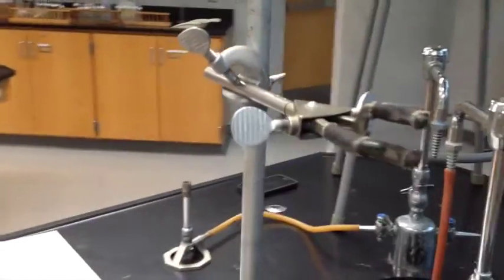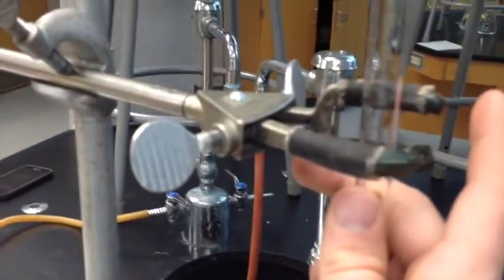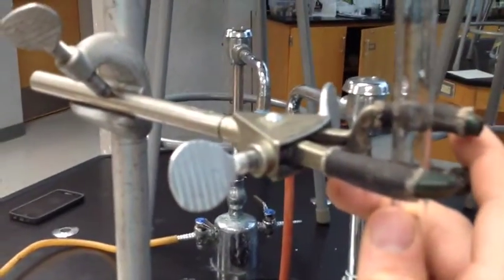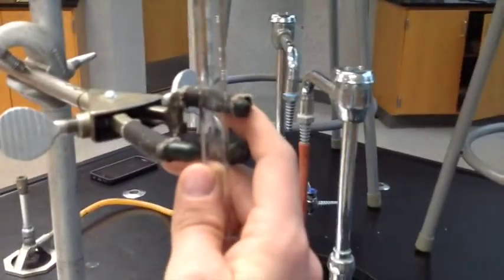Aha, there it is. Use a clamp, a 3-fingered clamp, and you'll slide it in and have your partner tighten both set screws. Now it's important that you don't over-tighten those screws. You can squeeze it too tight and shatter the burette, and you'll be out 40 or 50 bucks and out our lab results, so don't do that.